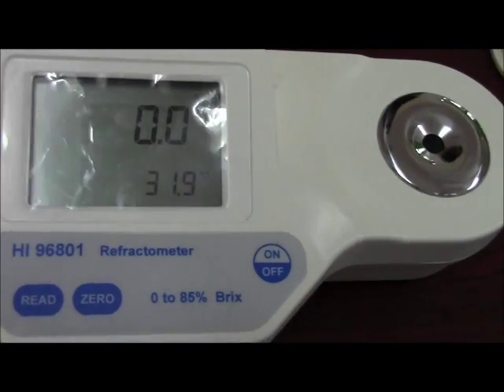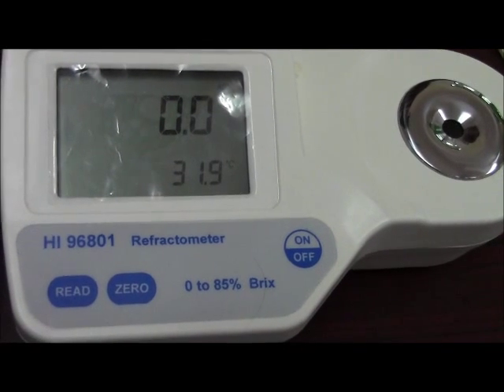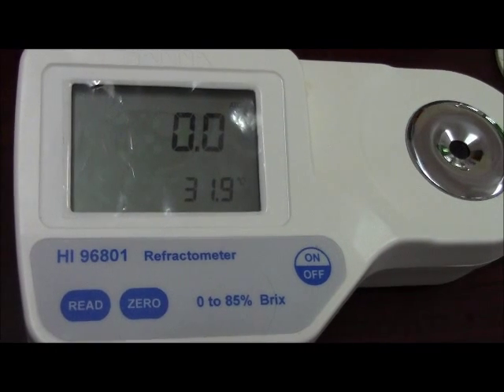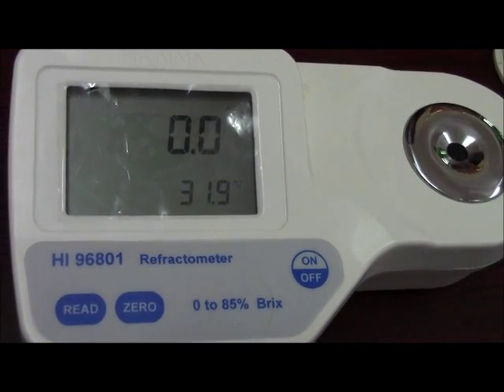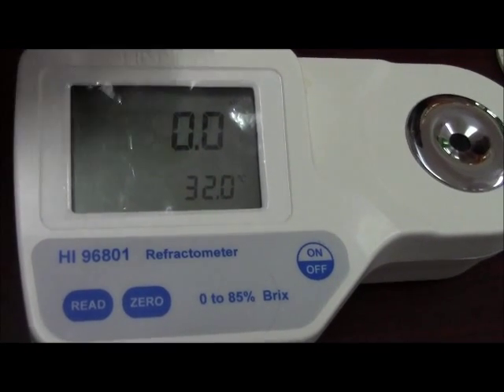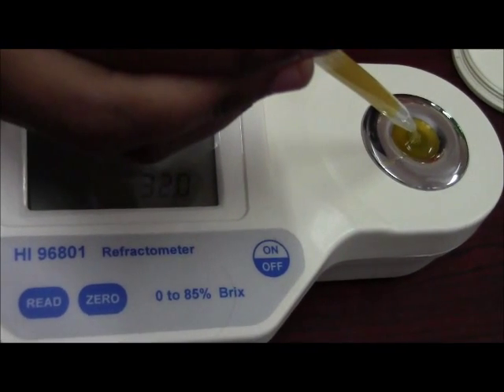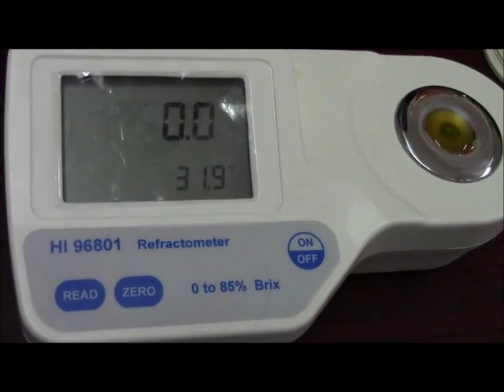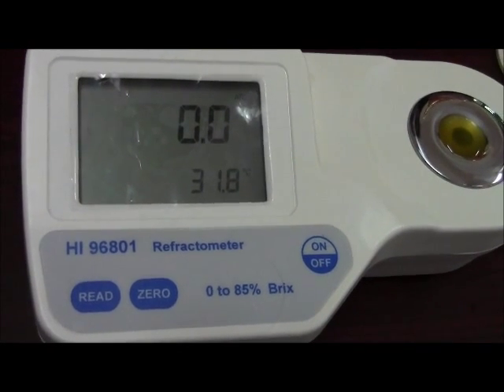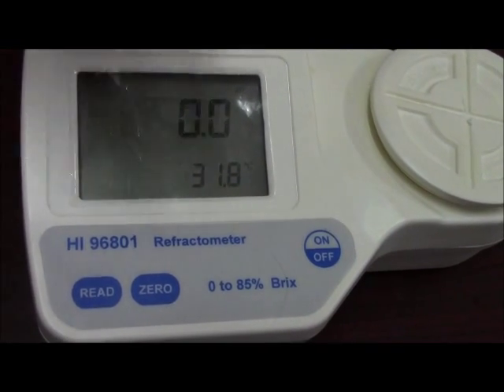We will check it with another sample — that is your Slice. Take a few drops of your Slice juice, cover it, and press your read button.